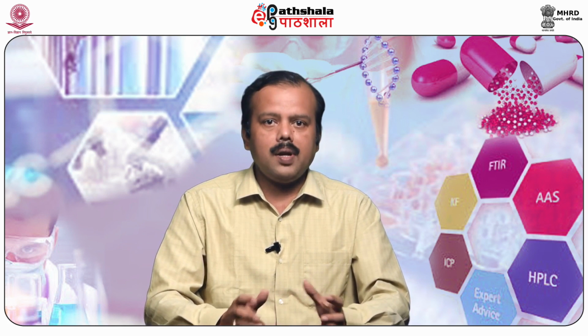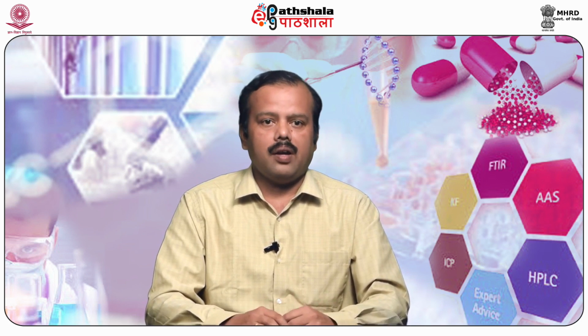Preparation of microbiological media. How we can prepare the microbiological media to carry out antibiotic assay. The microbiological media required for preparation of test organisms are made from culture media ingredients like beef extract, yeast extract, peptone, sodium chloride, agar, etc. The different compositions of media are given in table number 1.